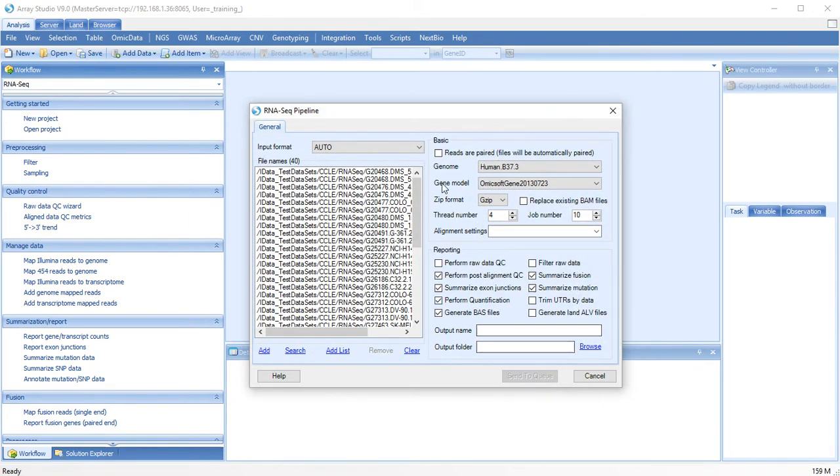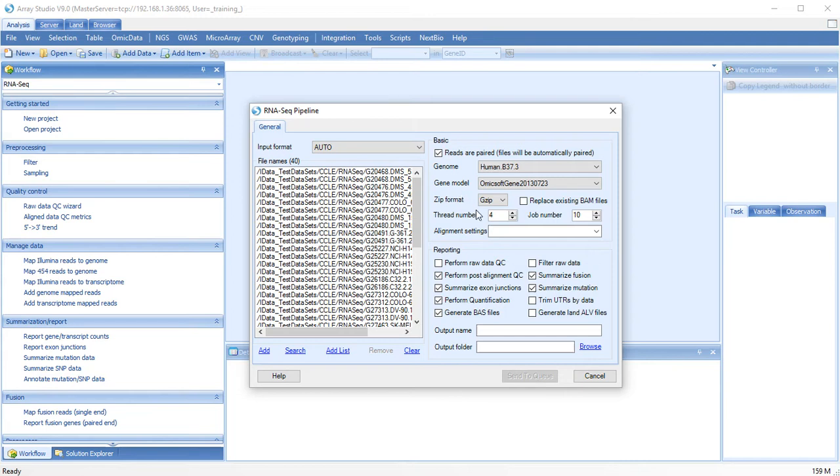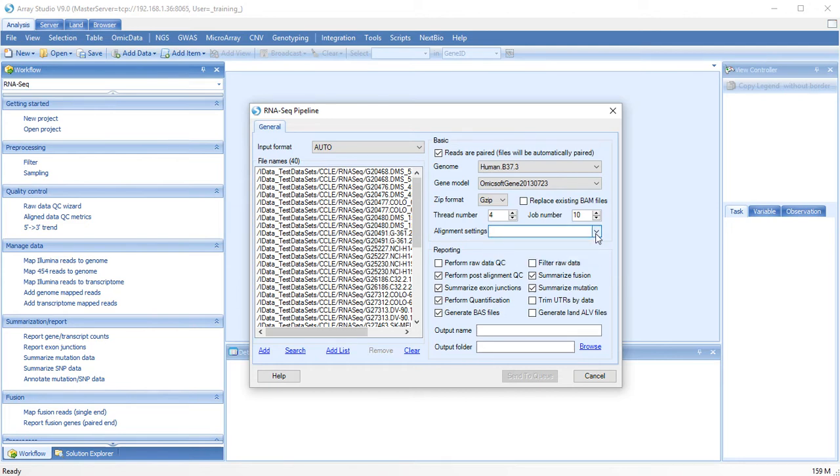Since this is a paired-end analysis, we will check the reads are paired box, choose our genome and gene model, specify the number of threads to be used, and specify any additional alignment settings. Users can also choose which modules to run, and name an output name and folder.